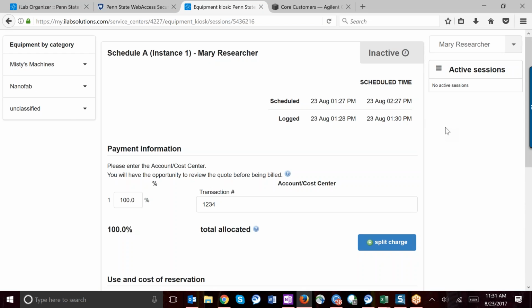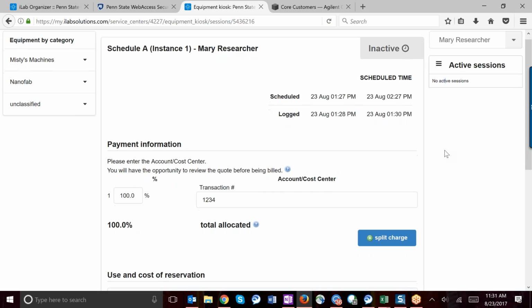All right. Any questions about Kiosk? No? All right. Misty, did I get everything? Is there anything else I'm forgetting to cover? I don't think so. Okay. I think we're good this time.